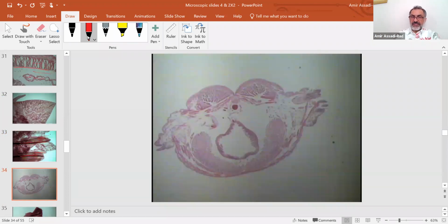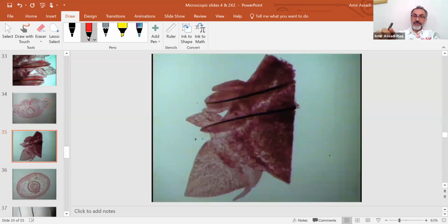Okay, Nereis virens, cross section of it, parapodium, intestine. These are longitudinal muscle, circular muscle, nerve cord, blood vessel, coelom, epidermis outside. I think I missed something. Okay, very good. So this is your parapodium. This is notopodium, and these are neuropodium. And of course, this is aciculum, and then you don't see the setae. So notopodium, neuropodium.